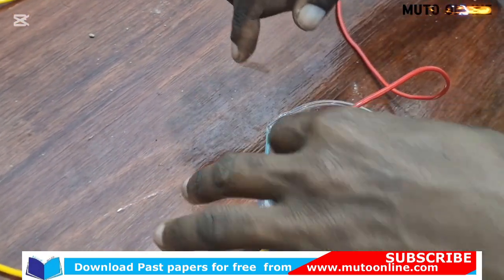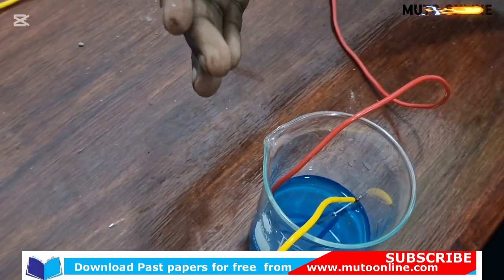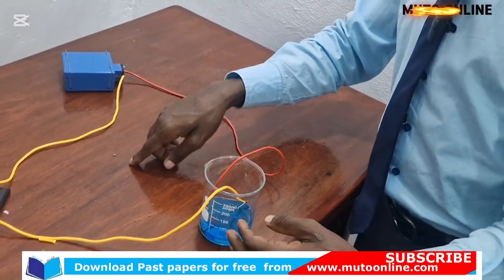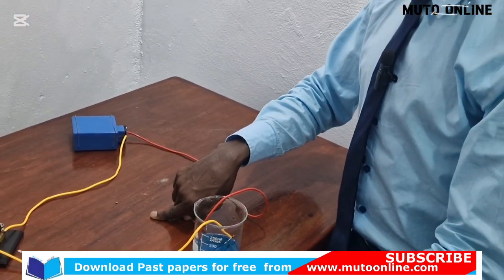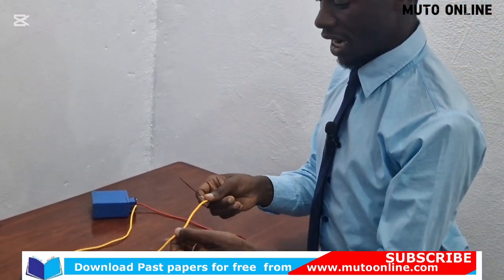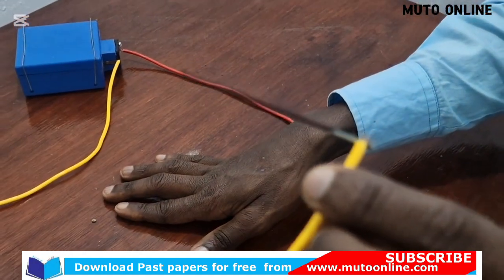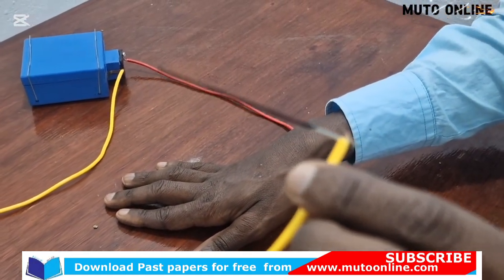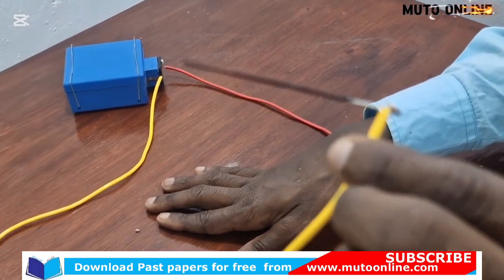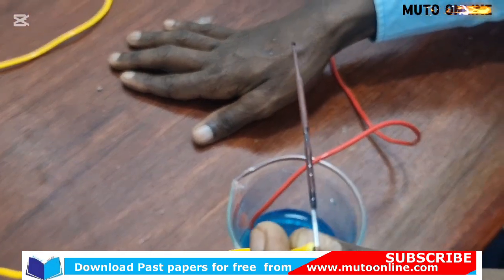It is because copper is being discharged from the solution. The copper ions are gaining electrons by electrolysis, by reduction process, and forming copper, which is deposited around the pin, like we are seeing. The copper is forming around the pin. So chemistry is real because whatever we teach is practically possible.